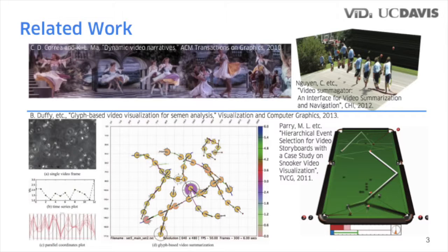Great work has been done for video visualization and summarization. They can be categorized into two types. The top row shows the keyframe-based method, which trims the content of videos and emphasizes more on the presentation of featuring frames. They blend foreground motion to a 2D background or 3D time-space volume. This kind of method is less often used in scientific studies, such as cellular behavior visualization, because scientists usually expect to see the continuously changing pattern of cell features to be visualized and analyzed.